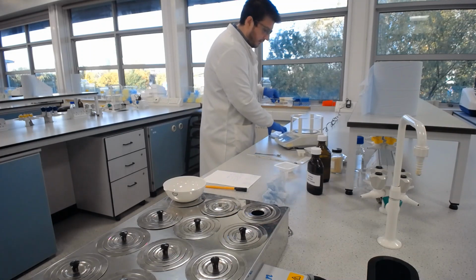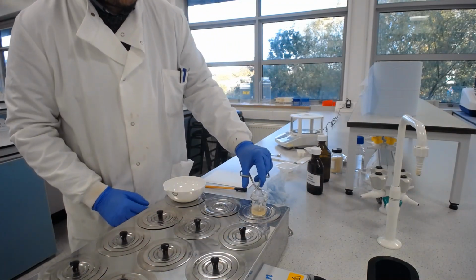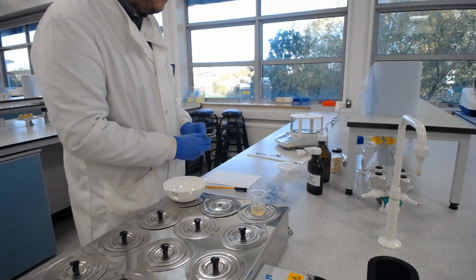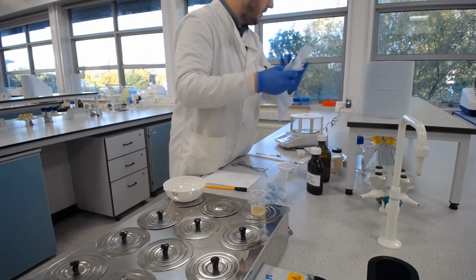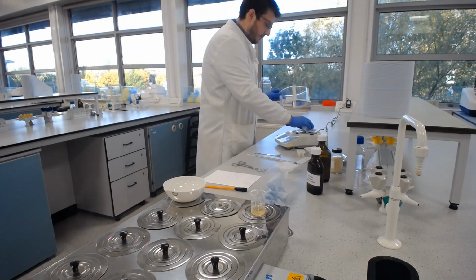So what you'll find on this as well, what I should have done there, is you need to wipe off the condensation from the bottom of the beaker, because otherwise that will be adding to the mass that you are weighing out, that you're measuring. So I'm just going to quickly get rid of that water.